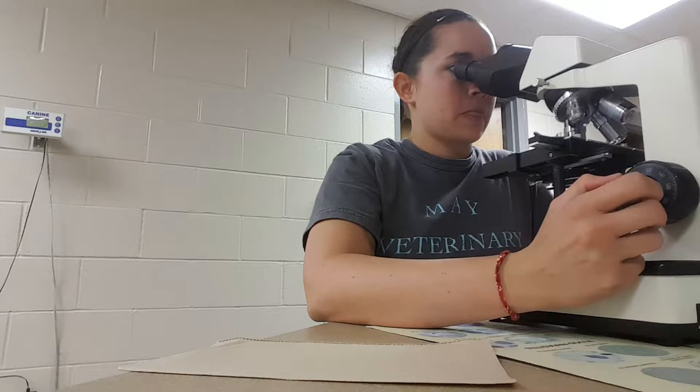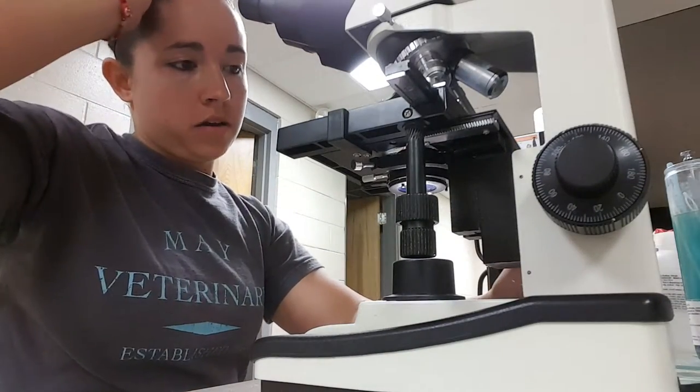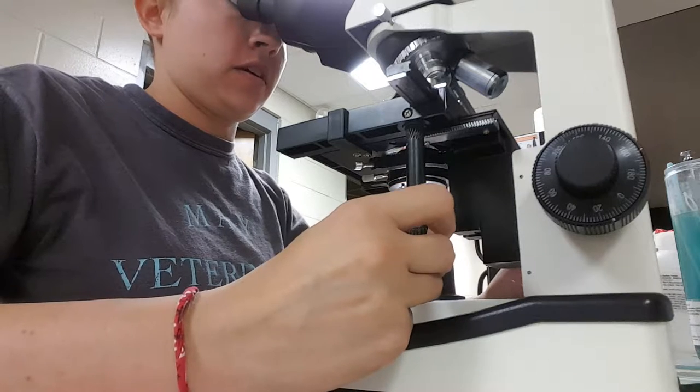There we go. And now I'll just watch for movement. I'm going to scan all across this cover slip just in a little grid formation, and I'm just looking for movement of the microfilaria.